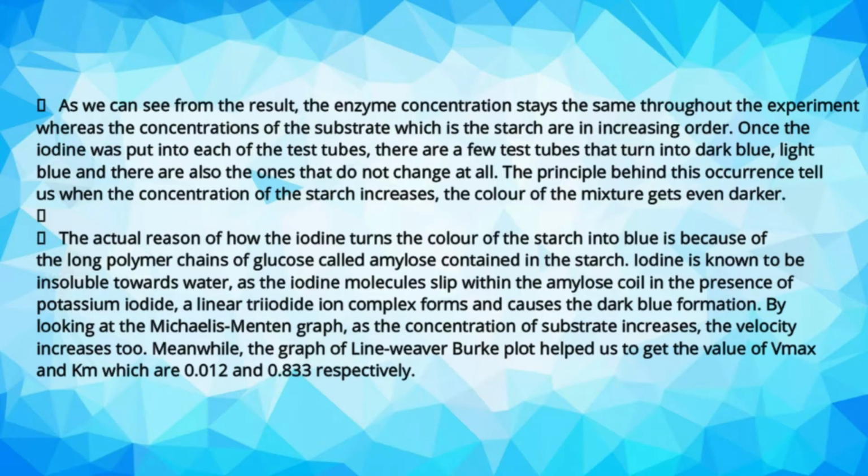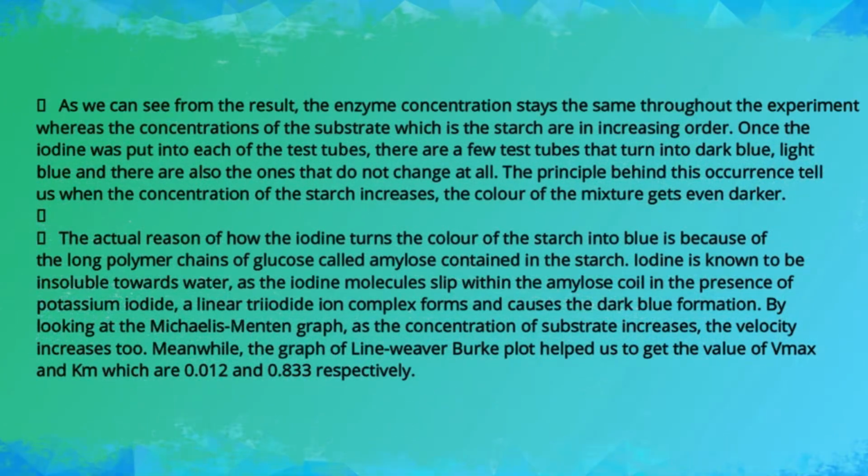By looking at the Michaelis-Menten graph, as the concentration of substrate increases, the velocity increases too. Meanwhile, the Lineweaver-Burk plot helped us to get the values of Vmax and Km, which are 0.012 and 0.833 respectively.